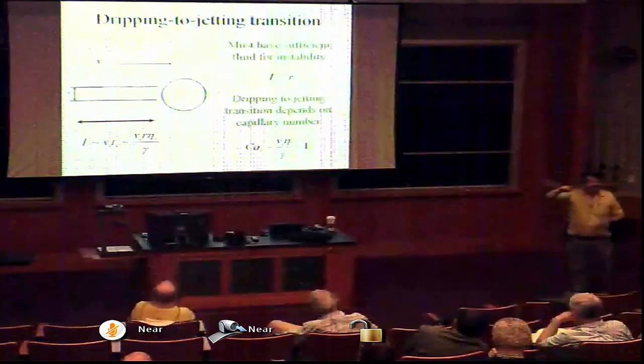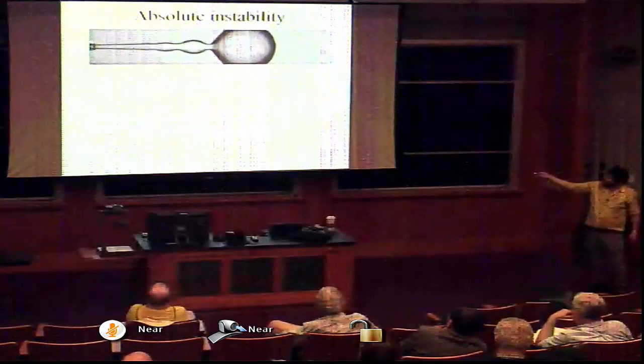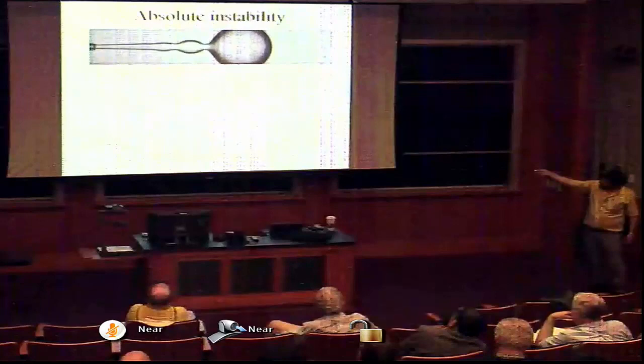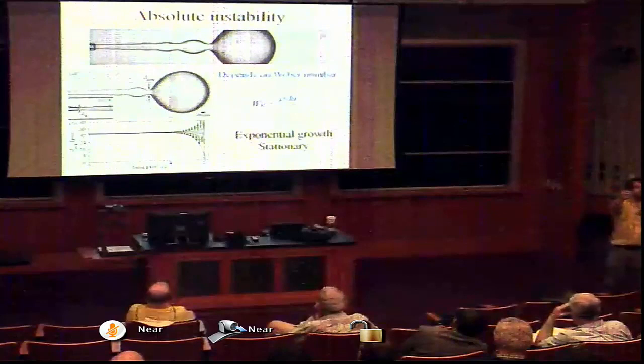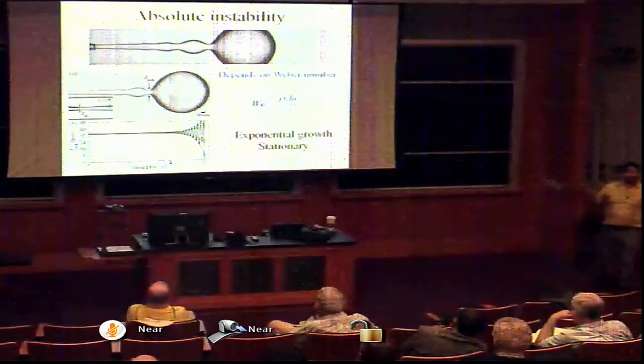Actually, there's another kind of instability that occurs here, where if you look carefully, I put some small particles in the inner fluid, and you can see they're flowing very, very rapidly. So in this case, the inner fluid is flowing so rapidly that inertial effects are important. So here what happens is it flows rapidly, and if you watch here in particular, you see it start to oscillate, you see these growing oscillations. If I measure this, you see it's all the hallmarks of a growing instability. This is a stationary instability because it doesn't move downstream very much while you get these growing oscillations that cause the snap-off. This depends on the inertial effect, so it's a balance between inertia and surface tension.